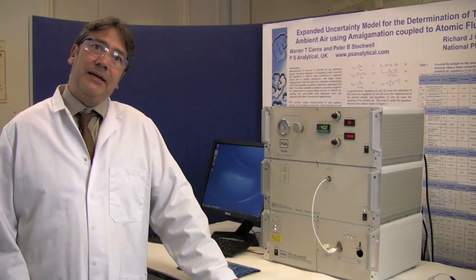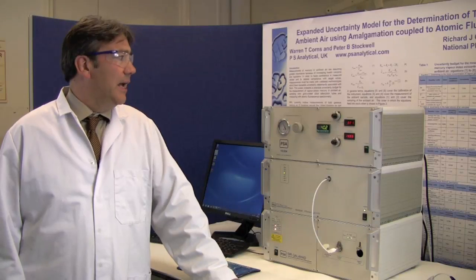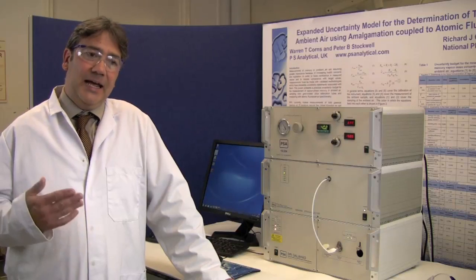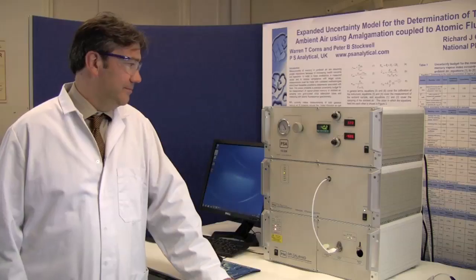In this case we take elemental mercury in a chamber, we pass a gas across the reservoir which becomes saturated and we dilute this gas using mass flow controllers to generate a span gas of known mercury concentration. Thank you very much.